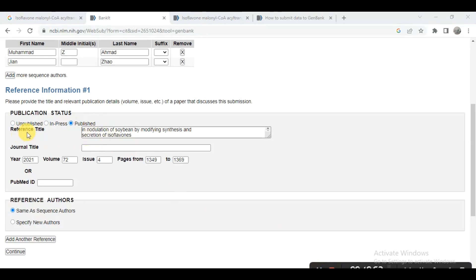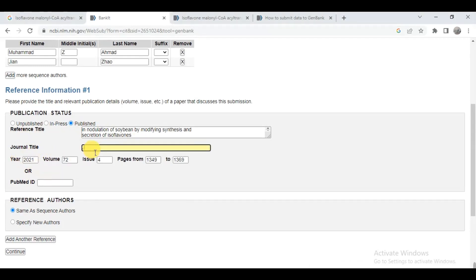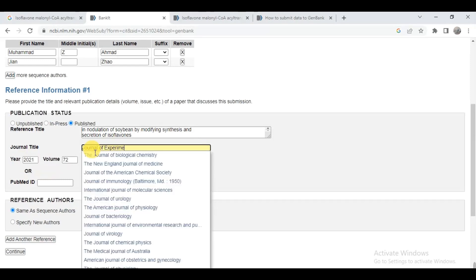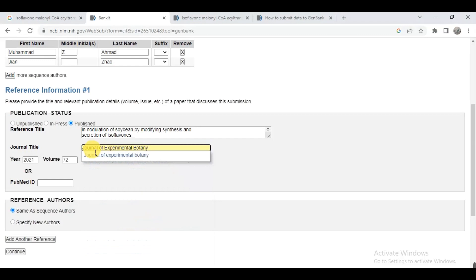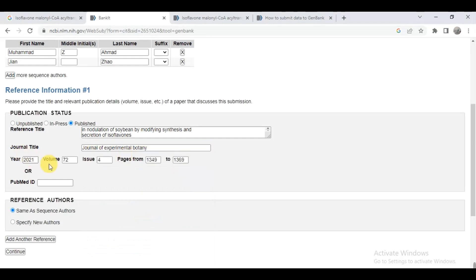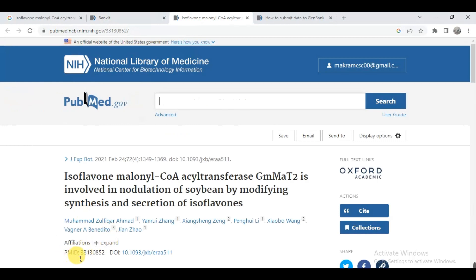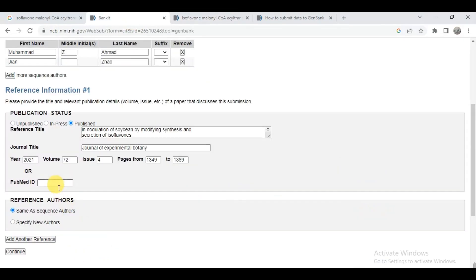Here you can give details such as the title, year, volume, and journal name. You can also enter the PubMed ID — simply copy and paste it here. Then click continue.